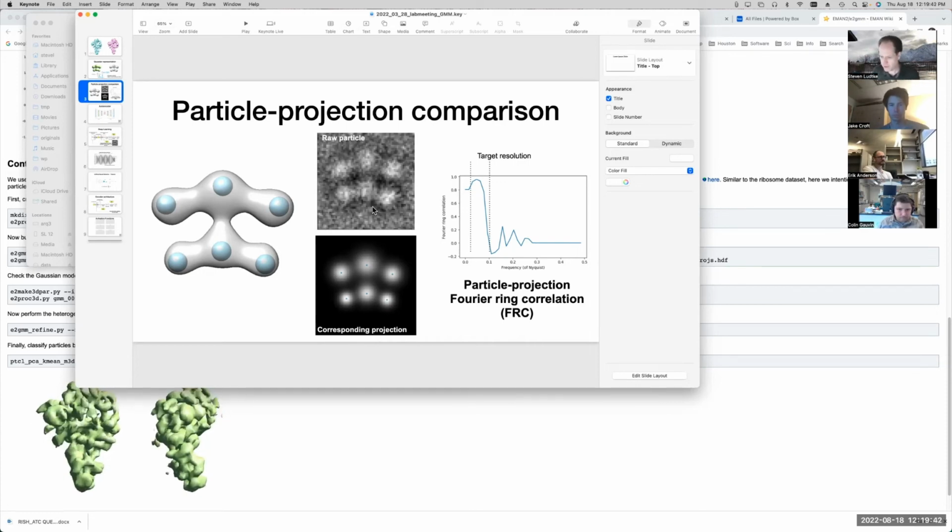And that's why you can't just solve this problem using traditional linear algebra approaches. If you had 3D volumes and 3D Gaussians, and then you had gradients for each one, you could just use something like a singular value decomposition. And you could solve it with linear algebra and come up with an optimal solution for how things must be moving.